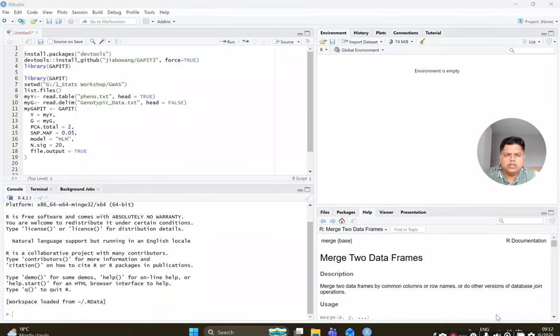The present video shows how to do GWAS for a trait known as 1000 kernel weight in wheat. 1000 kernel weight is the weight of 1000 grains in wheat, and we have a genotypic file of SNPs, high density SNP markers, single nucleotide polymorphisms. We have around 12,000 markers.